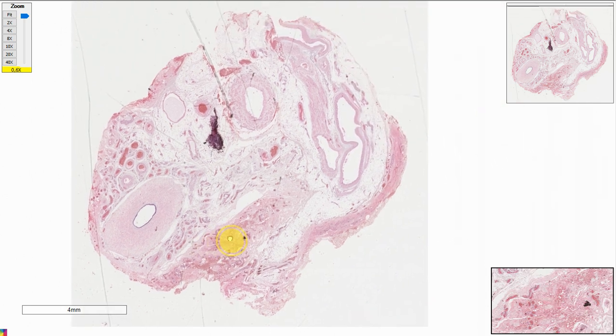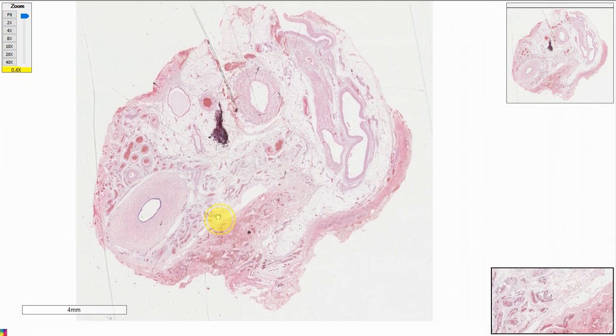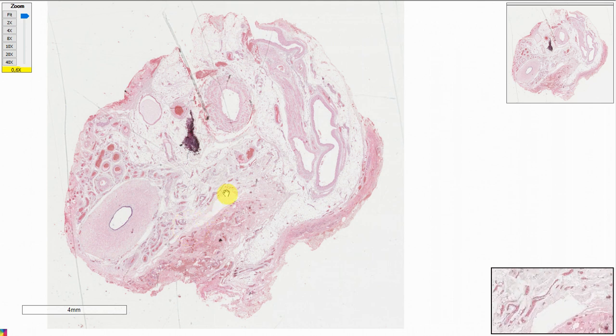So anyway, in conclusion, within the spermatic cord, we have the vas deferens. It's very thick walled, composed of 3 muscular layers, and the luminal area is lined by pseudostratified epithelium with stereocilia. It has this muscular wall which is designed to contract and propel the sperm. Understanding all the structures may help you understand any pathological event that occurs either in the vas or in the testis.